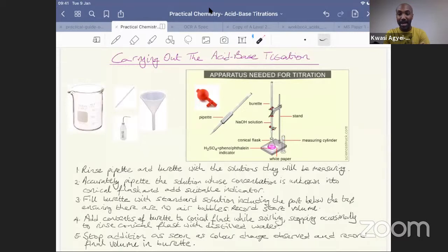So in this titration, it looks like we're at the end of the titration because the indicator used, phenolphthalein, shows pink in alkaline solution. So you've got sodium hydroxide solution from the burette being added to your acid, and when all of the acid has been neutralized and there's just an excess of your alkali, it goes pink.